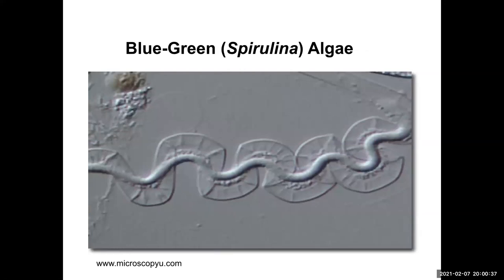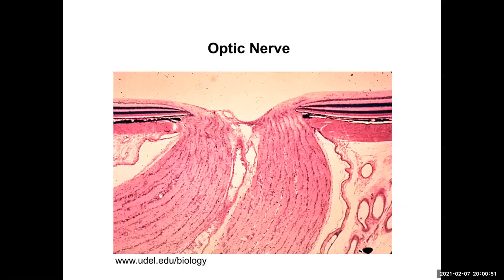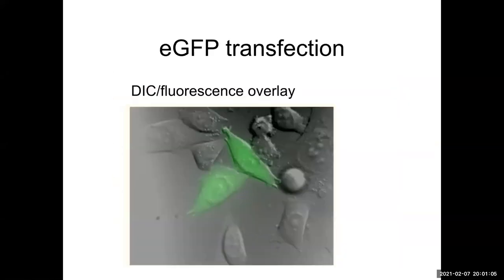How about this? Oh, it's the same worm as before. Hint: it's not stained. Hint: it's not phase. Yes, it is DIC — the other contrast-generating technique. There's a lovely optic nerve, and yes, it's bright field — that characteristic H&E stain that histotechs are so well known for.